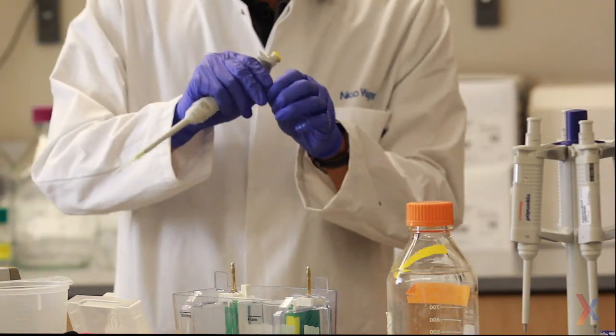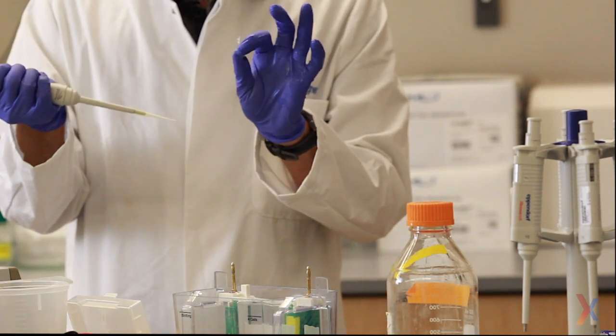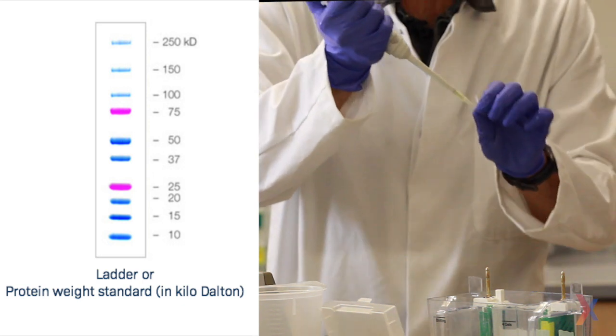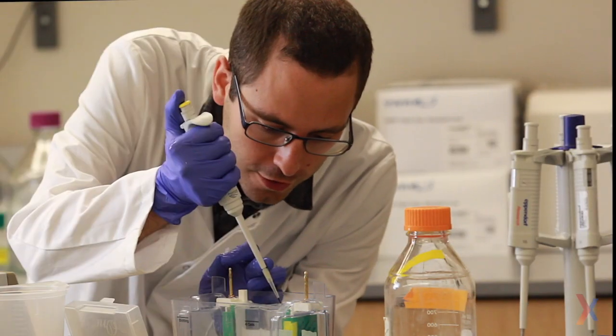The first thing I like to load is the ladder, which will give us a reference point later to see how large our proteins of interest are. So I will load this one first.